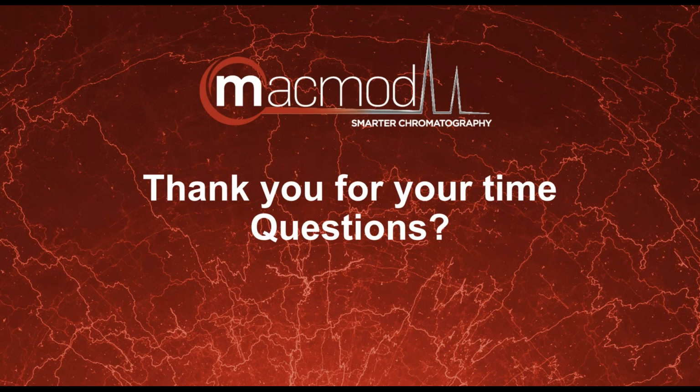So the first question: have those columns been tested with antibody drug conjugates? So we're looking at this. You need wider pore sizes to handle that. The 300 angstrom material just came out. So to say, have they been tested? Not at this time, but we have another brand of products that is used specifically for that application that gives excellent results for the ADCs. Okay, so maybe we can follow up with them after.